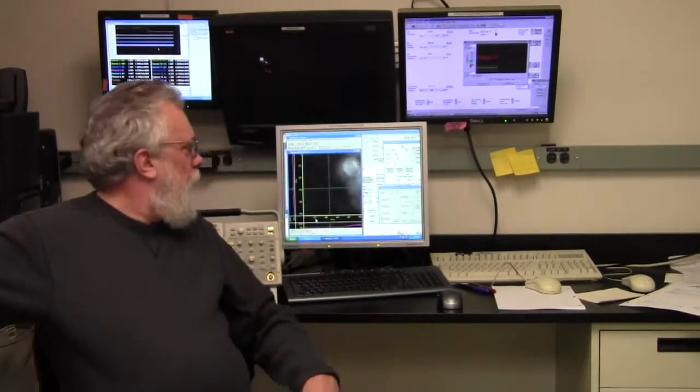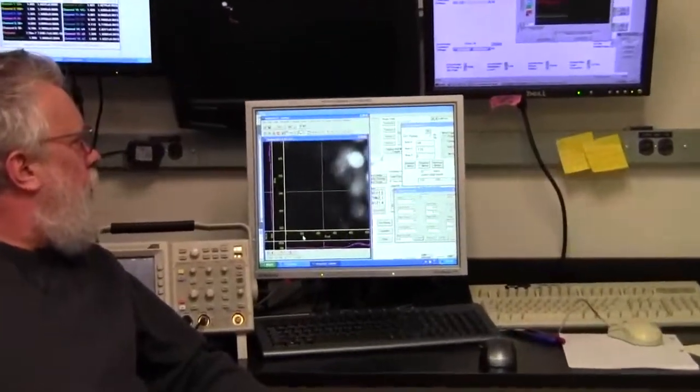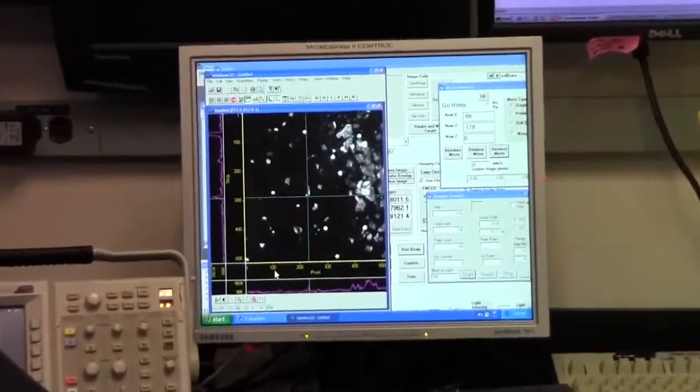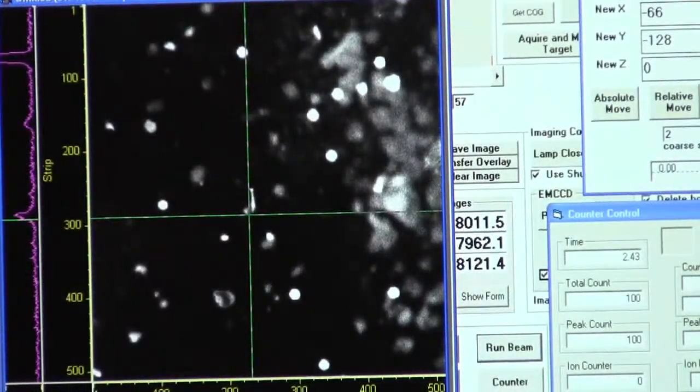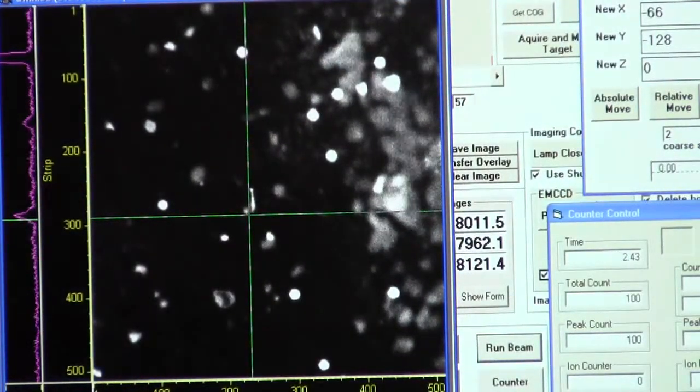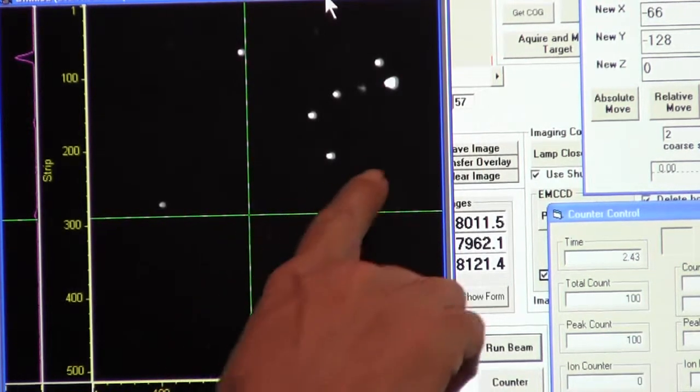So now we've exchanged the knife edge dish for one that has fluorescent beads on it and let me focus the microscope a little bit. So the bright spots here are the fluorescent beads. Let me adjust the intensity.